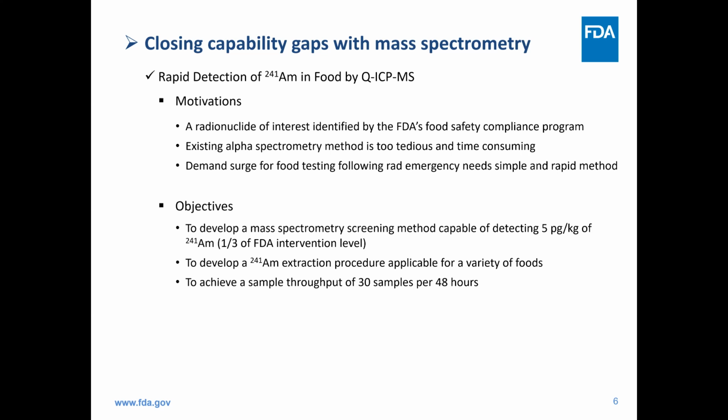The first, sensitive enough to detect Am-241 at 5 picograms per kilo. Second, applicable for a variety of food. And third, capable of analyzing 30 samples per 48 hours.